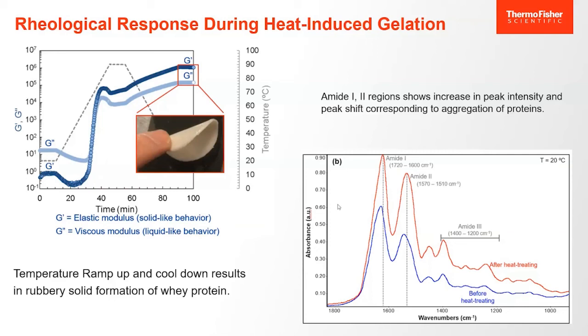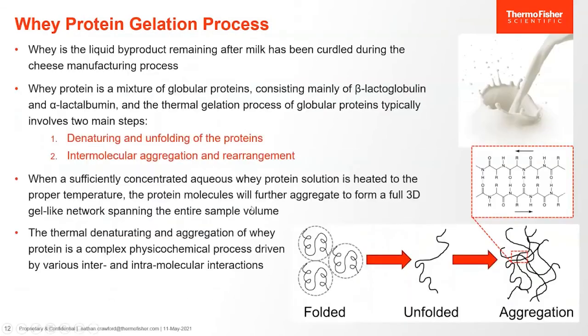So what did we learn from this study? Basically, whey protein, when you start off in the solution state, is in a nice folded state. It unfolds as the temperature ramps up, and it results in aggregation, and the whole gelation process happens.